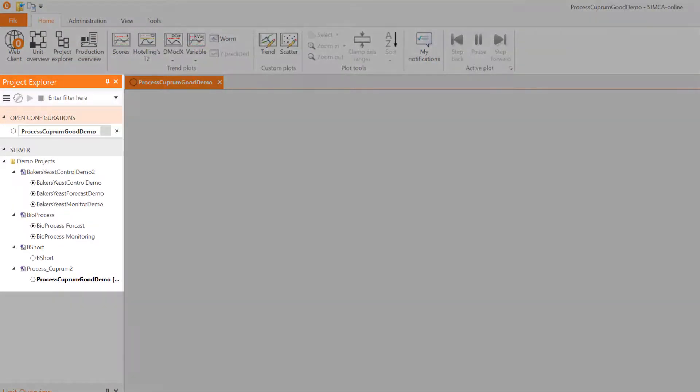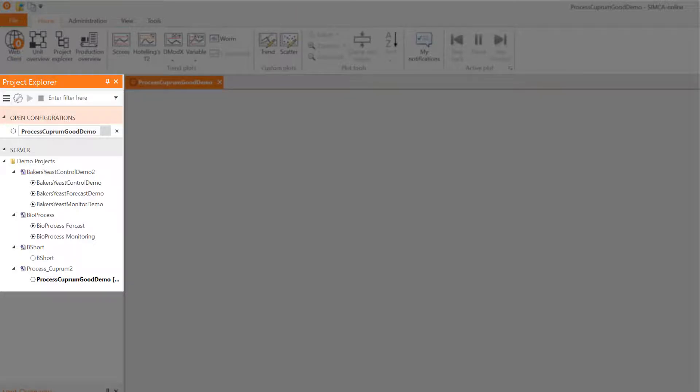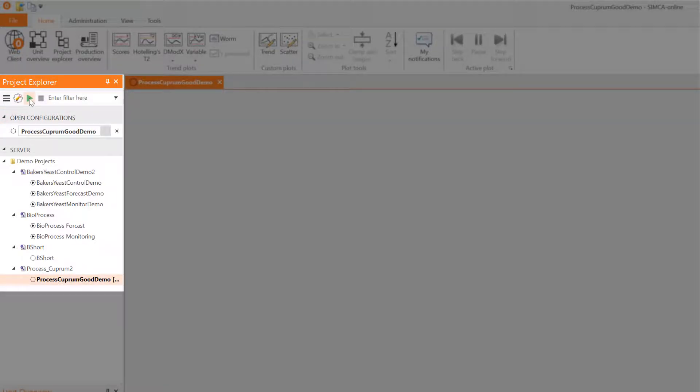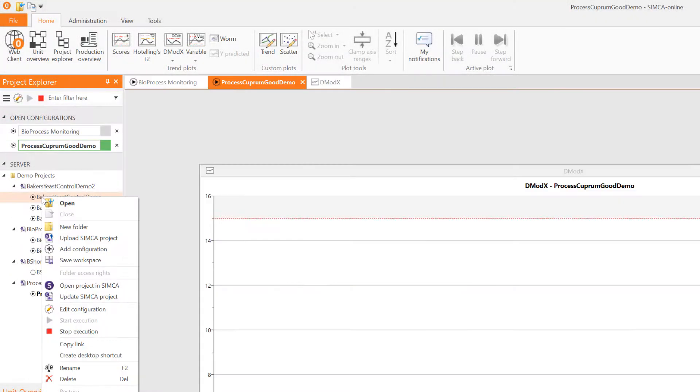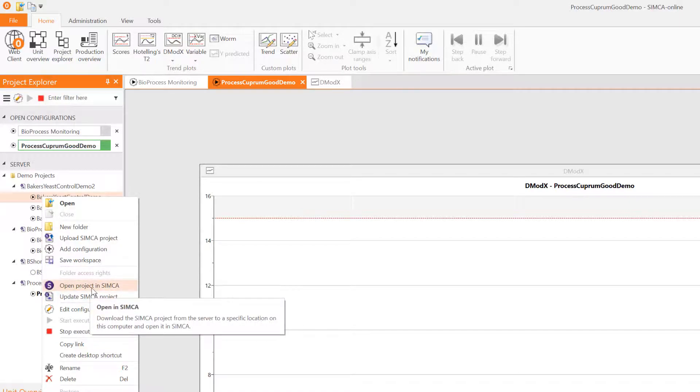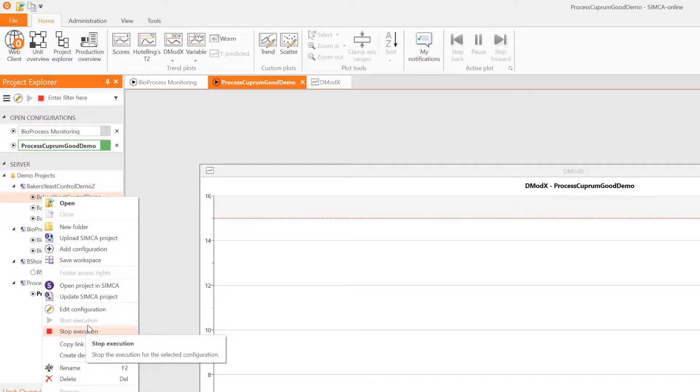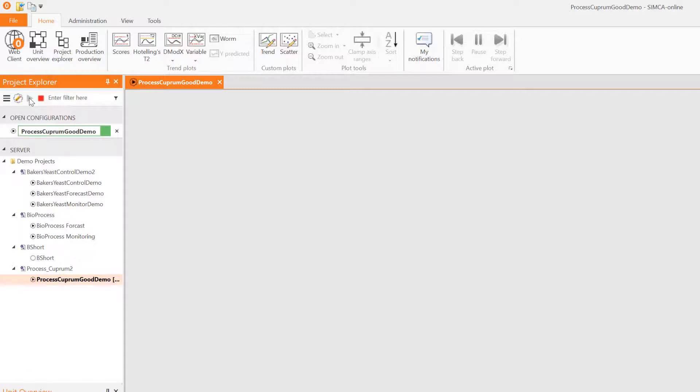The project explorer in the left hand pane is where you, as an administrator, manage what the users should see and where you, as a user, open the configurations that represent your processes. This is where you upload, configure, start execution of and open your projects.